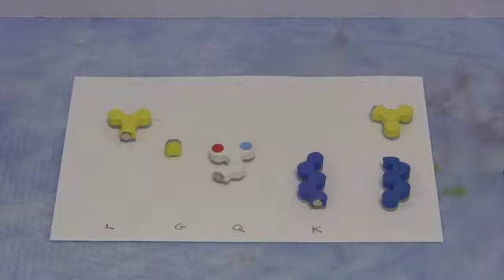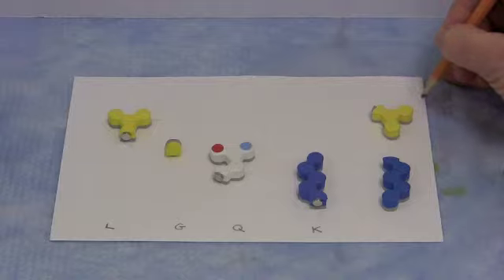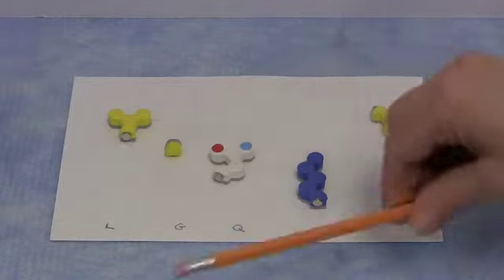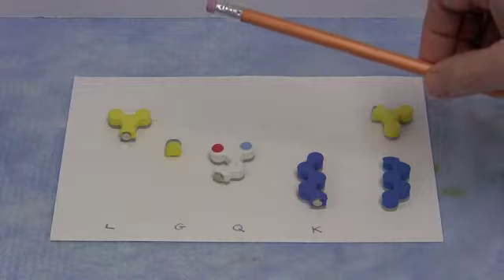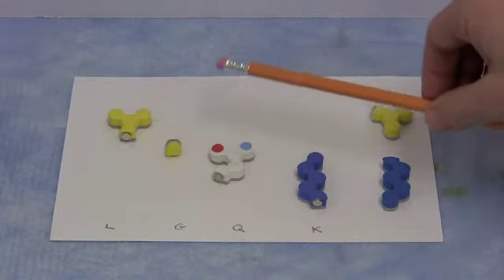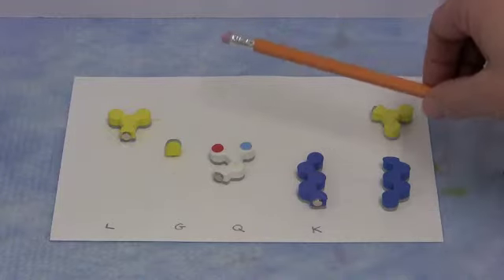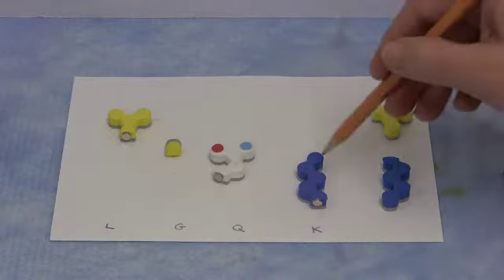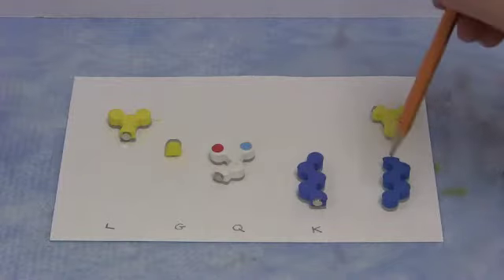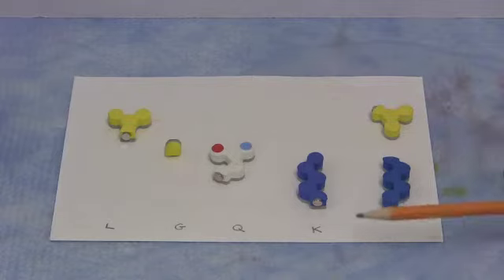When you're done with the chromatography, you're going to mark the solvent front with a pencil, and then you're going to dry the whole thing out and spray it with ninhydrin. As it stands, you can't see the amino acids, they're just clear colorless spots, but the reaction with ninhydrin will give you colored spots at the positions of the amino acids, so you'll be able to visualize where they are on the paper.